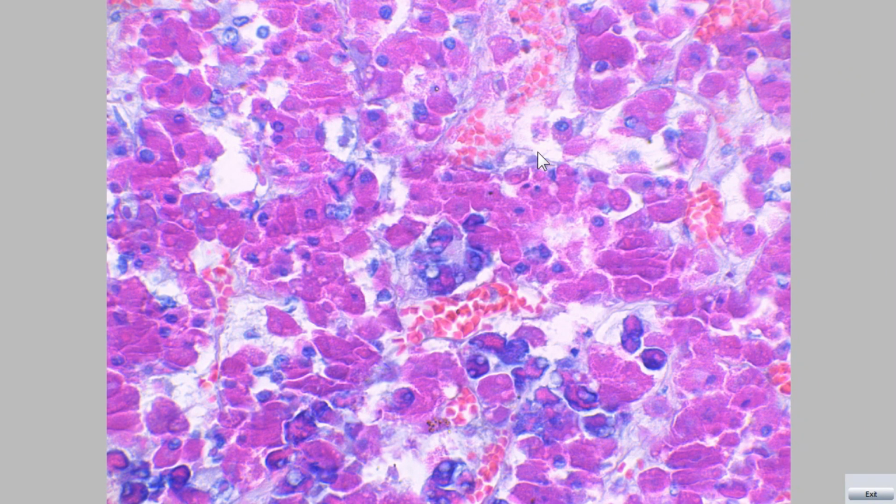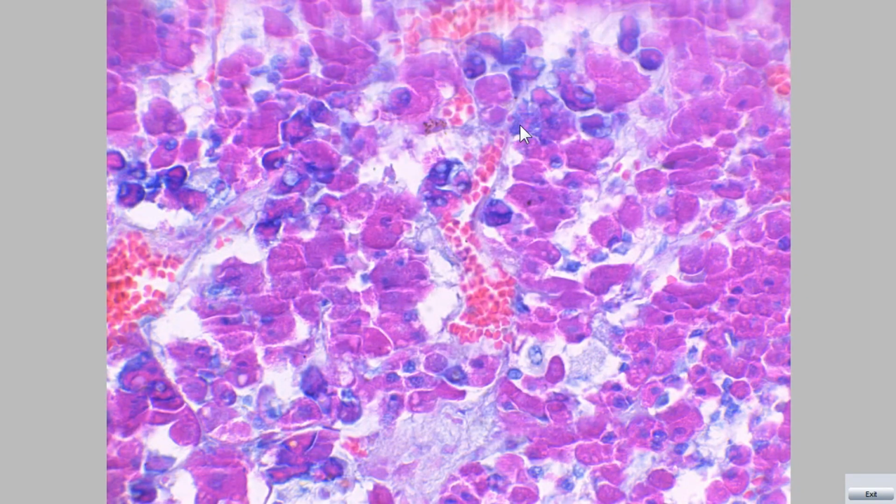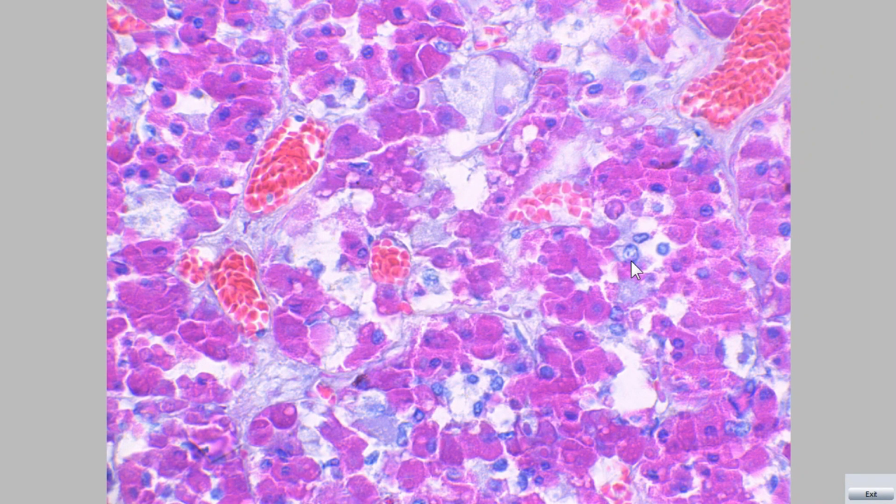Another group of cells is called the chromophobe. At the tip of the pointer, we can see the chromophobe, which stains weakly, with few or no cytoplasmic granules. These cells are a group of stem cells or undifferentiated progenitor cells.